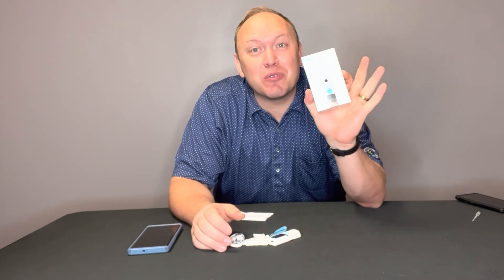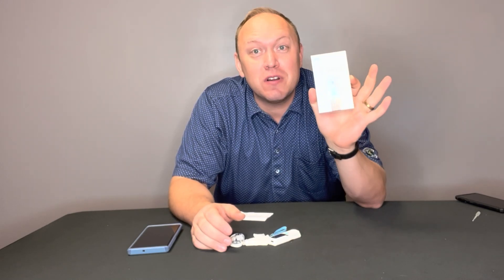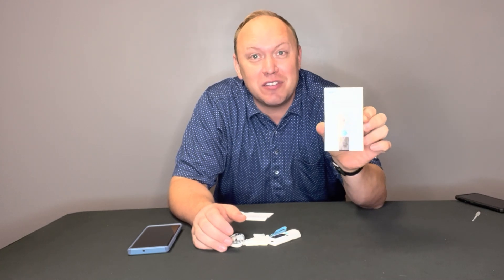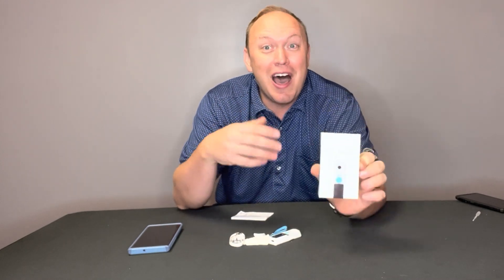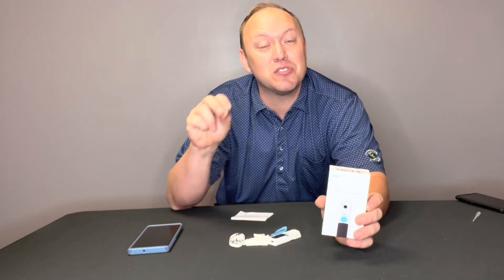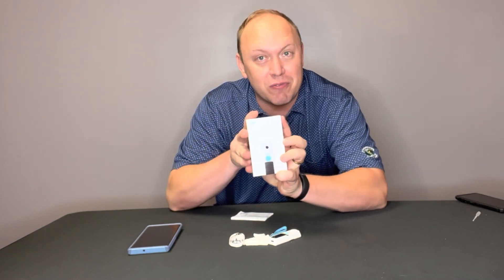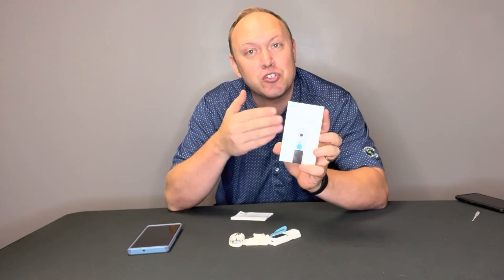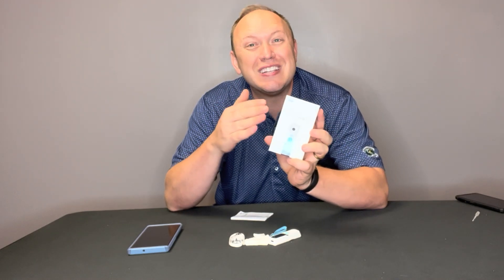Hey guys, I'm using this BRICS refractometer to measure the sugar content in the tomatoes that I test for my pizza blog. I'm also going to have some fun with it and test out some sugary drinks as well, just to check in and see what the sugar content in each of those solutions is. A refractometer, specifically a BRICS refractometer, is a device that measures the amount of sugar in a solution using light.